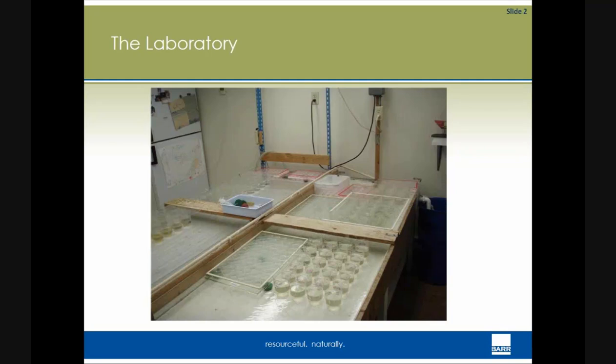Another thing this reminds me about is feeding. During some of the tests, feeding is conducted. So fathead minnows get a certain kind of food during the test. So does Ceriodaphnia dubia, and the algae don't get fed, but they have a nutrient broth that they're provided throughout the duration of the test. So this is a standard, typical laboratory testing setup. And this is actually the lab that we used in the study. Well, on the next slide, slide 3.